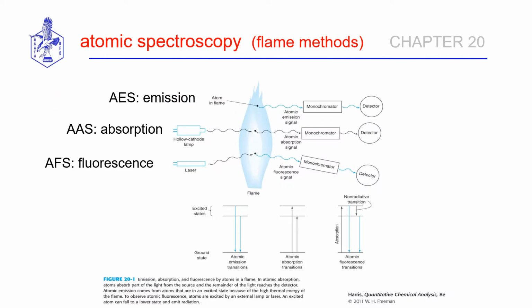Now we want to focus our attention on the atomic spectroscopic methods in which we get our analyte species up into the gaseous ground state form using a flame. We're literally going to introduce our solution into a flame with an oxidant gas and a fuel gas that combusts. What we're doing, if we have an absorption method, is my species ends up in the ground gaseous atomic phase.